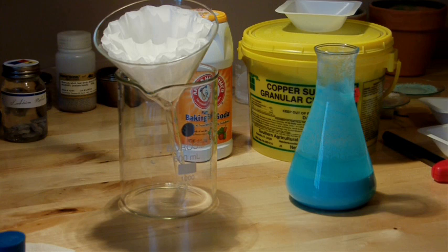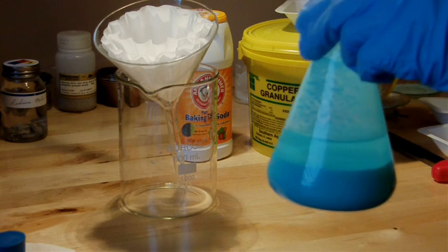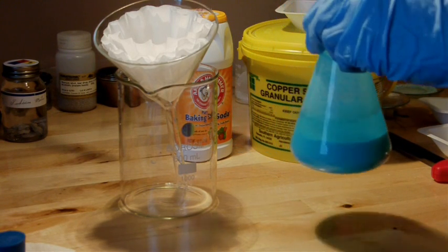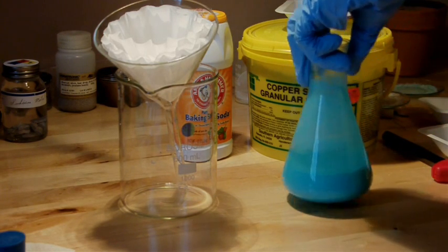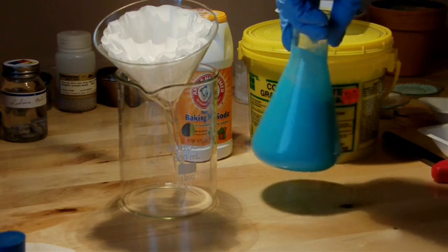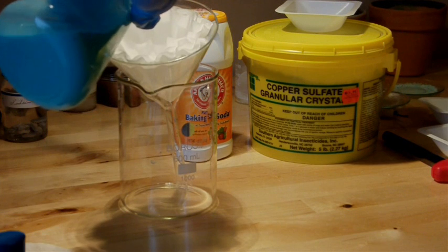This is pretty much done reacting. Copper carbonate is very insoluble in water, so you can see it's settled to the bottom quite nicely, leaving a layer of water above it. I'm going to filter off the solid and collect it for the next step of the experiment. I'll mix it back up so I can pour it out easily, and pour it into the filter paper.